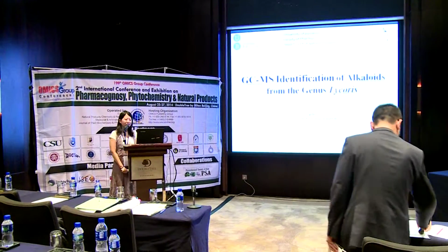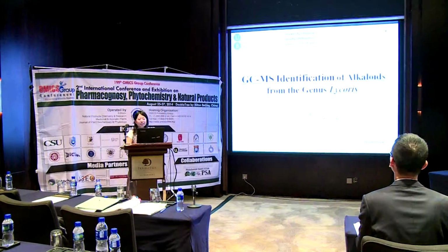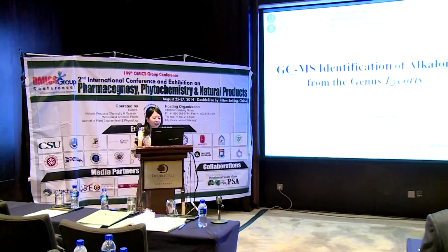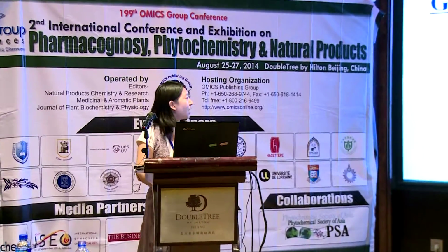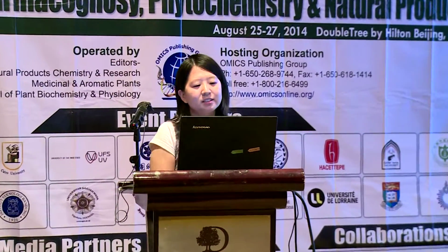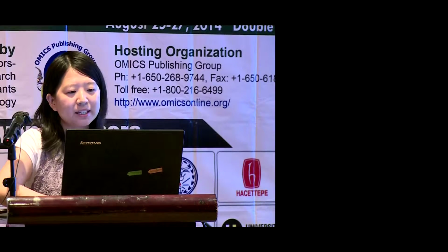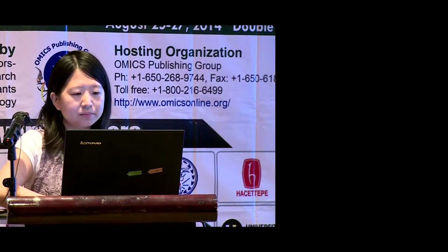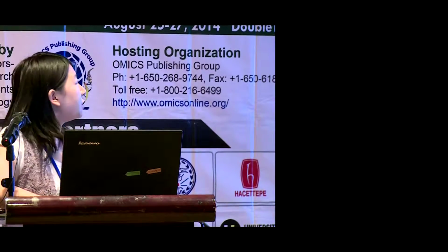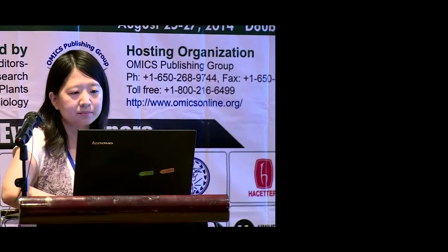Hello everyone, good afternoon. I'm Ying, I'm Chinese. Now I'm studying at the University of Barcelona, and my director is Professor John Basti. Today, my topic is GC-MS identification of alkaloids from the genus Lycoris. At the beginning, I will introduce some background knowledge: the genus Lycoris, alkaloids, and the GC-MS technique.